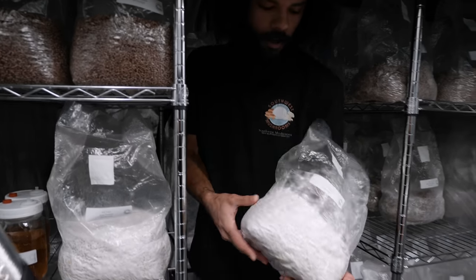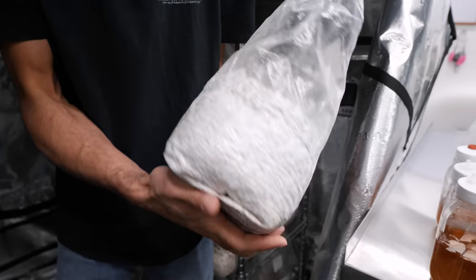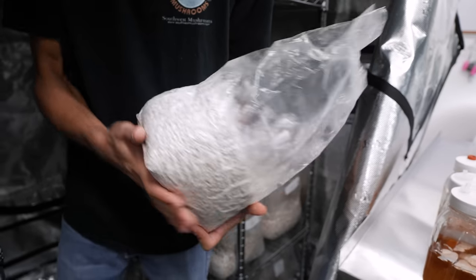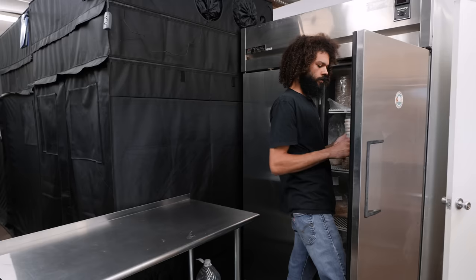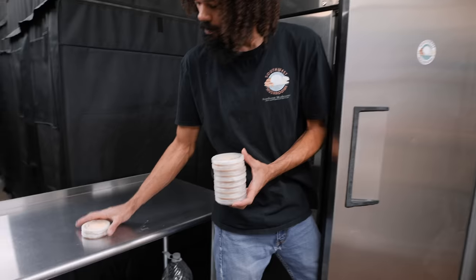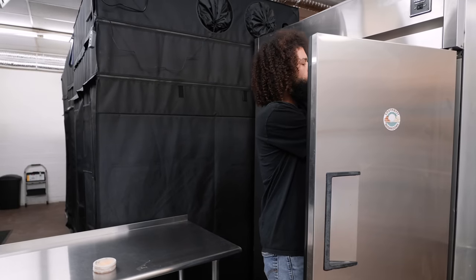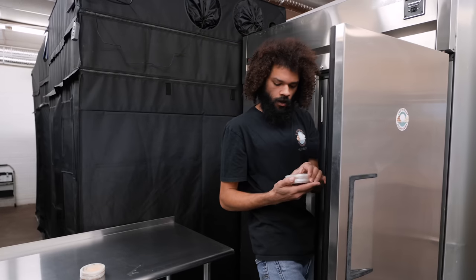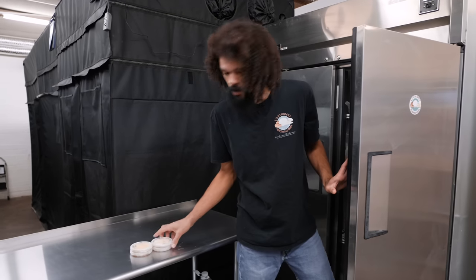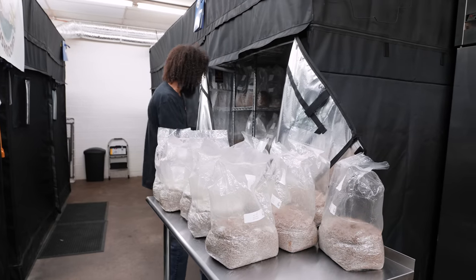Here we have some fully colonized G2 king trumpet — really nice, healthy mycelium. I'm also going to get some petri dishes out and utilize these to inoculate some grain. This is actually going to be a cordyceps inoculation, and now we'll make our way into the laboratory.